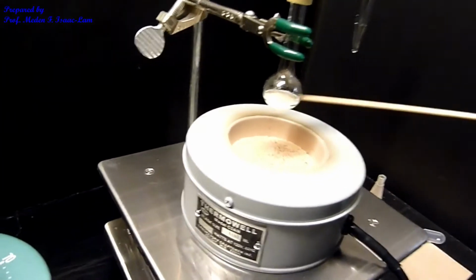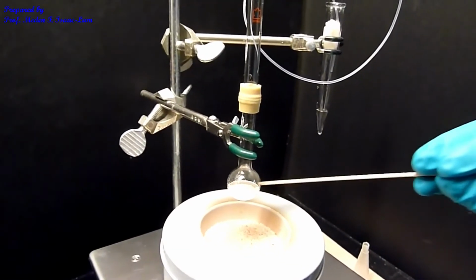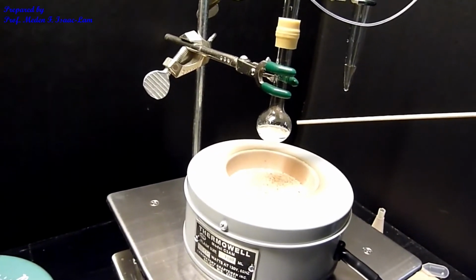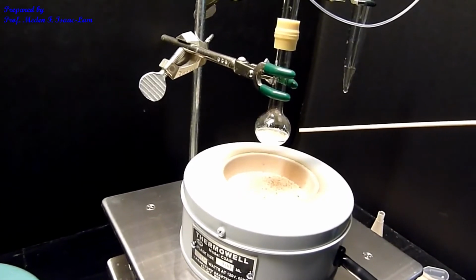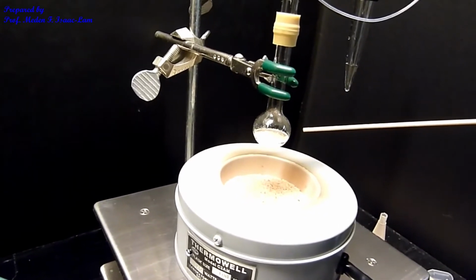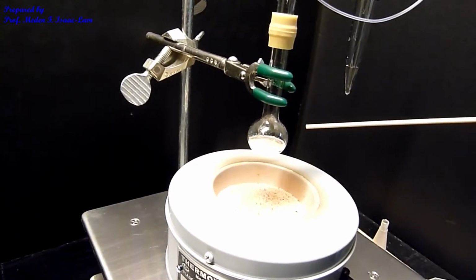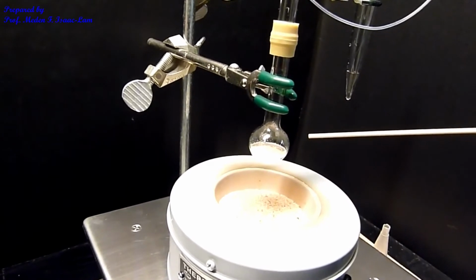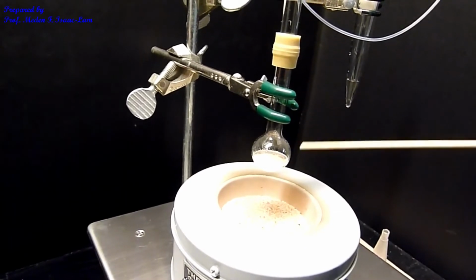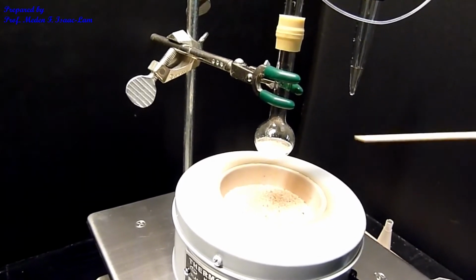So this is our reaction mixture. And then this will be refluxed. So in our mixture in here, first we have the NBS, N-bromosuccinimide. We have the peroxide, which is the initiator, and we now have the ethylbenzene, which will react to be brominated, and then the cyclooctane acts as a standard, because we want to quantify the amount of the product that is being produced after bromination, and then the carbon tetrachloride is just the solvent. So we have 5 things in here.